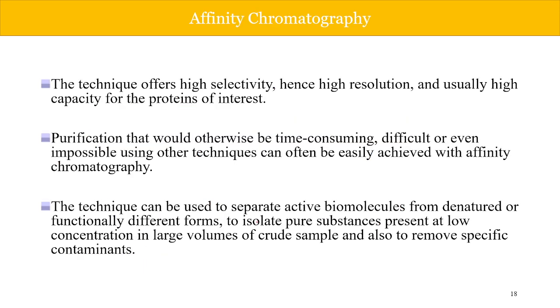Coming to the next type of chromatography, it is affinity chromatography. This technique offers high selectivity, hence high resolution, and usually high capacity for the proteins of interest.